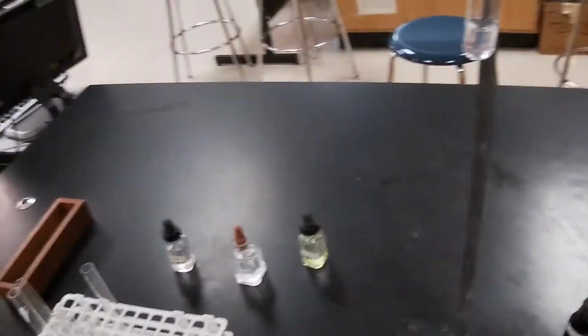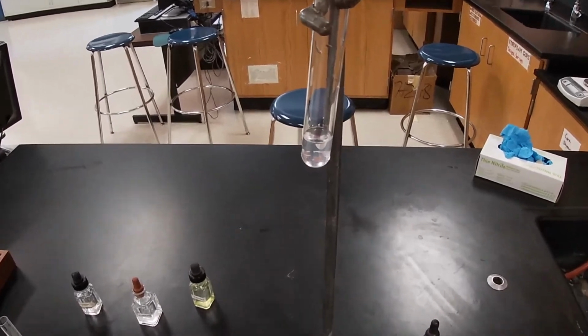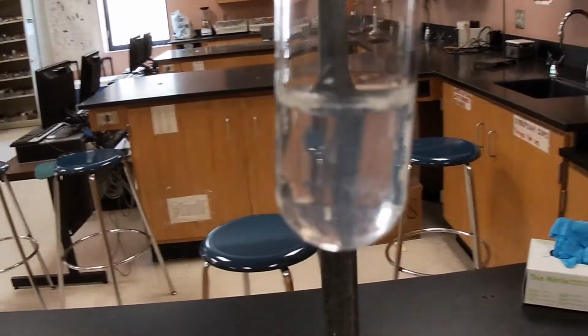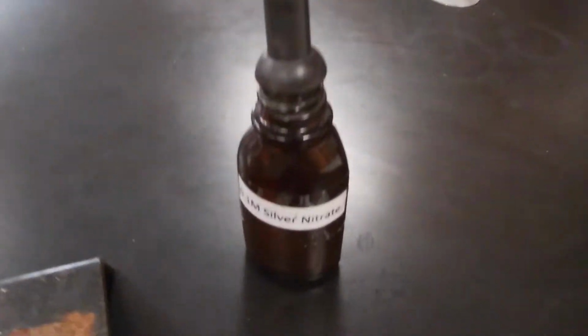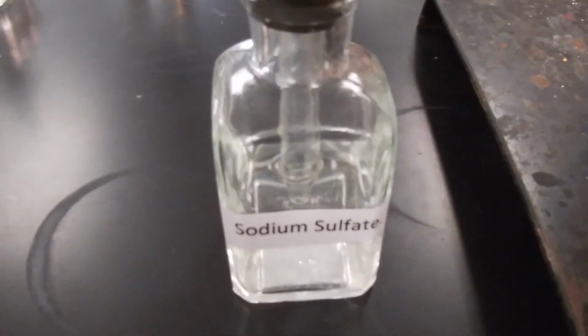So for sodium sulfate and silver nitrate solution, I'm going to take it off my head so that you can see it. I'm going to zoom in now. As I get closer, you'll notice that the solution remains clear and no precipitate was formed for this one. Again, this is a reaction of silver nitrate and sodium sulfate.